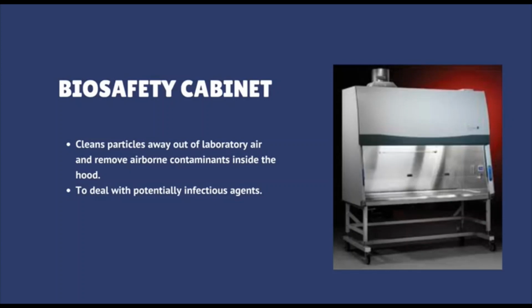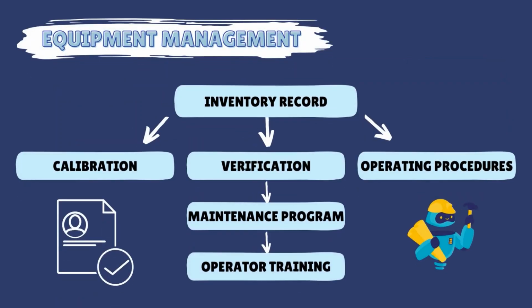Biosafety cabinets. It's quite similar to the laminar flow chamber, but it differs by cleaning the particulates out of the lab air and removing the airborne contaminants inside the hood, so it can be used to deal with potentially infectious agents. Now let's look into equipment management.